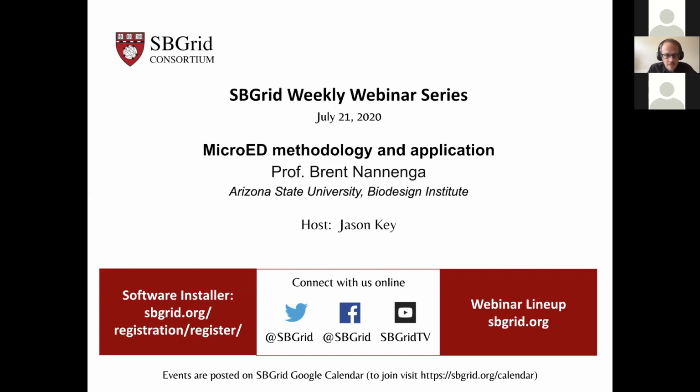And today, we're lucky to have Brent Nannenga joining us from Arizona State. We're going to be talking about microelectron diffraction methodology and application.